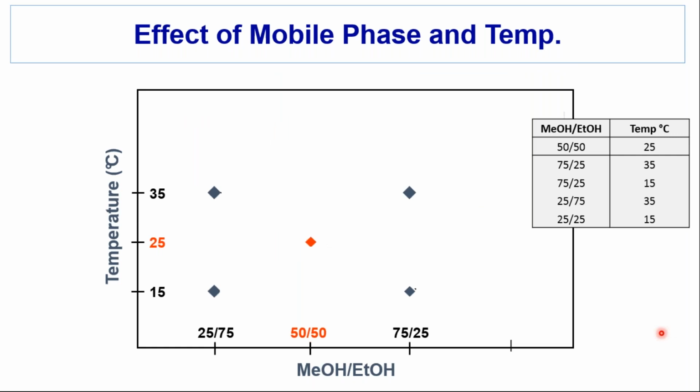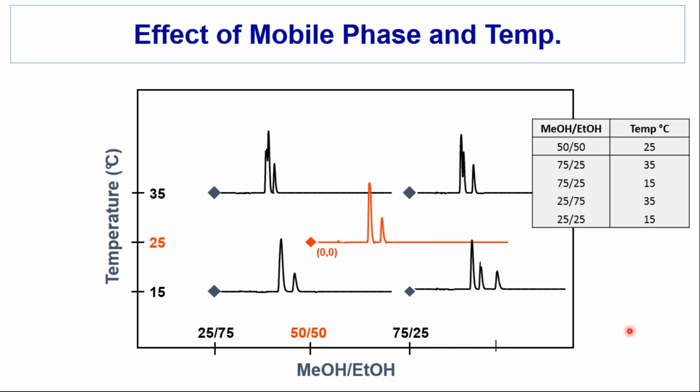With more complicated data, particularly when we have two parameters and there is some more complicated behavior, it's often useful to think of this like a factorial design. I'll go into a conference room or lunchroom and find a table where I can lay the chromatograms out in the way that they were run.